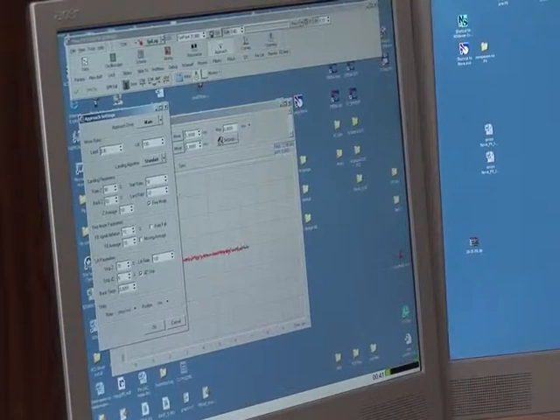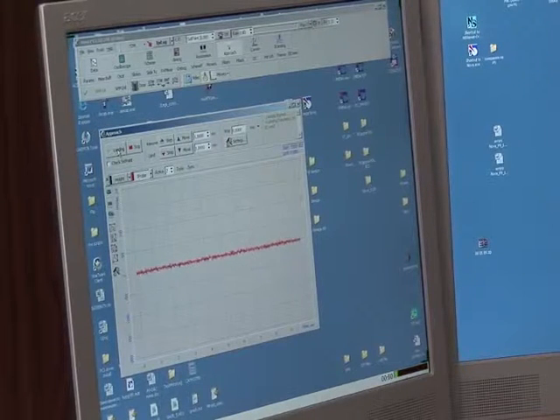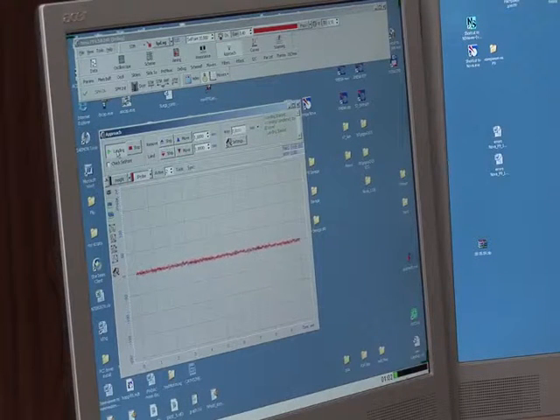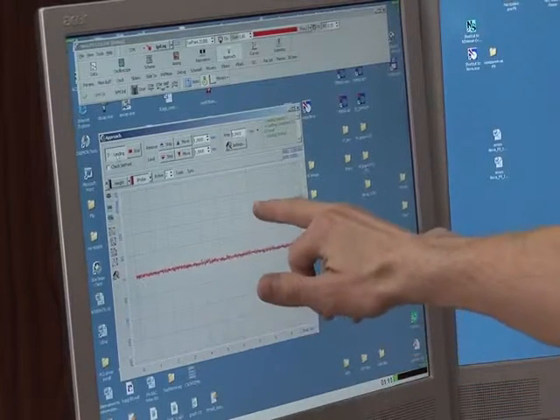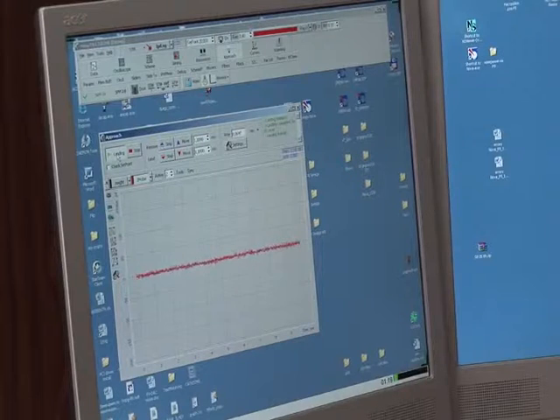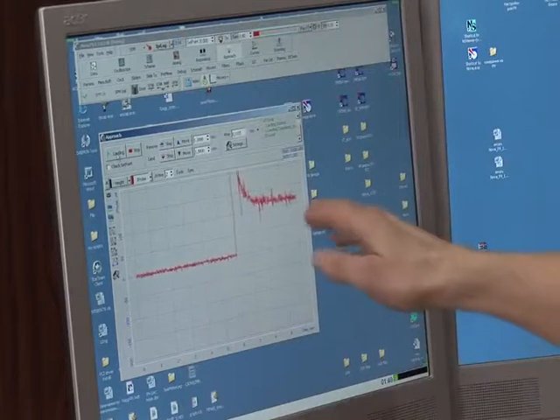For STM, we have to use very low speed to approach in order to save the tip. Run landing. I forgot to enable feedback. Now landing. We see the counter of the STM method. When we take approach to the surface, we will have some current jumping to a level of about 100 picoamperes. When we approach the surface, we will stop the video and then use screen capture to demonstrate scanning.